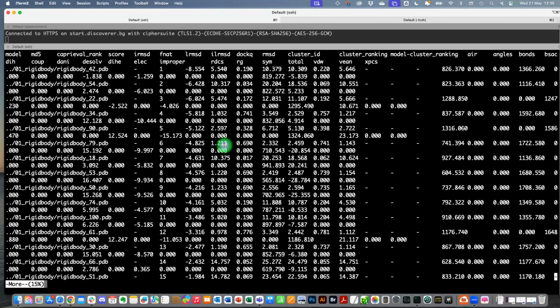And you get components of the score. So the first line gives you what is listed. You will find electrostatic energy, van der Waals energies, and all of that. And also the restraint energy and the desolvation energy. So you can find those statistics for the entire system. So this is the ranking, basically.